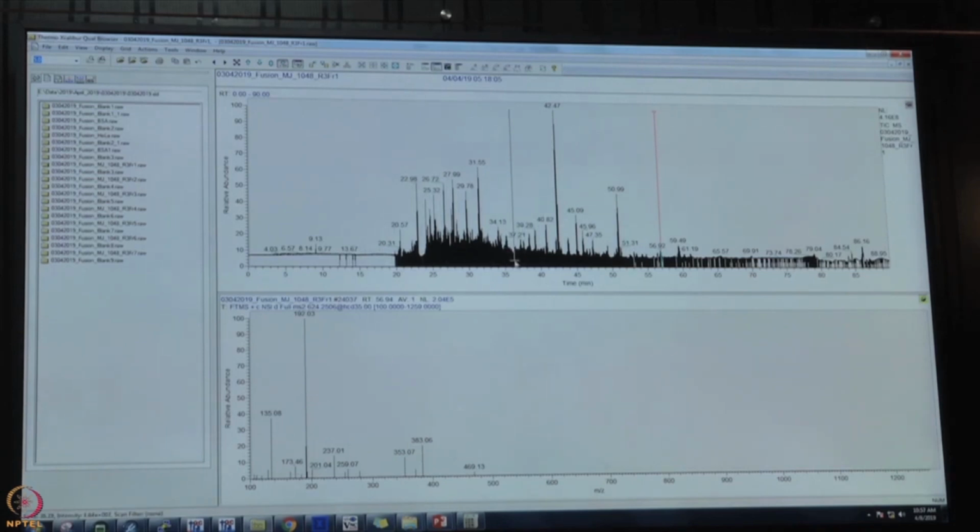The raw data that is generated is then further analyzed using specific software which can deduce the information in the chromatogram and reveal the identity of the peptides, subsequently leading to the identification of the proteins. I hope you got a very good glimpse of the mass spec based proteomics workflow, but how one could use this same set of information, this workflow, for any case study for any biological problem.